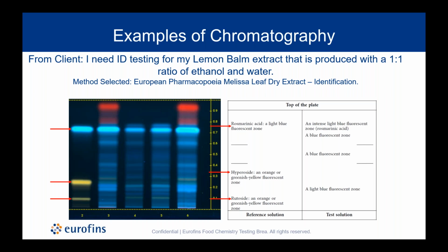So this standard is prepared with all 3 of these compounds, and they are showing the RF values and colors that are described in the method. So again, we know that our chromatography has been performed accurately enough to evaluate our test sample on this plate.